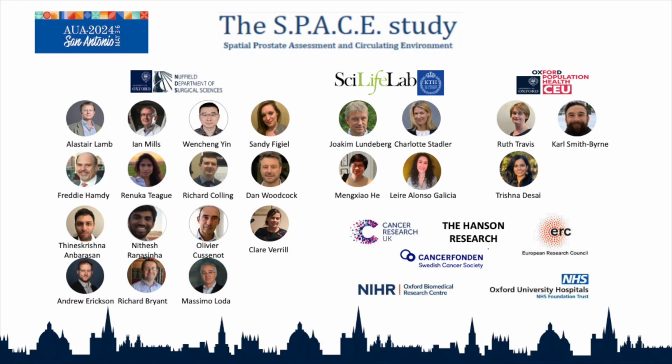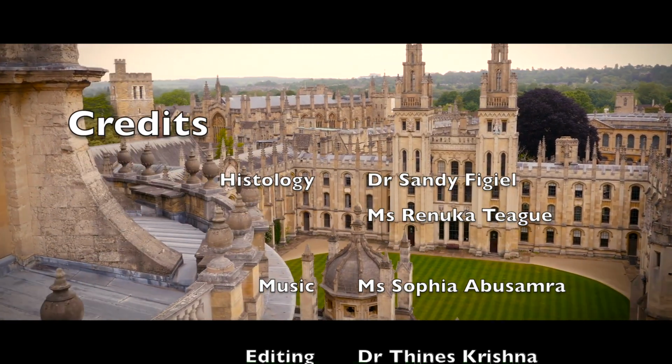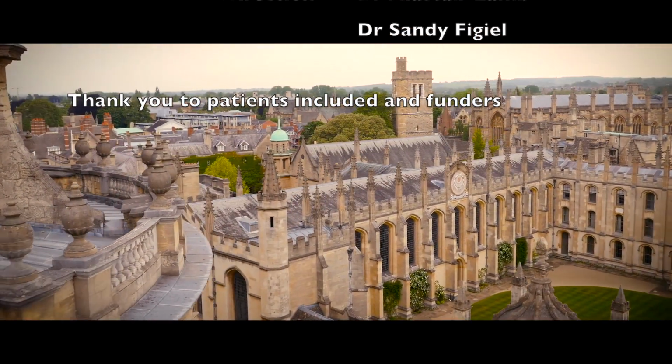We at the Oxford Prostate Cancer Biology Group are excited to share this video protocol with the wider scientific community. This work is part of the SPACE study, where we are uniquely positioned with our expertise on spatial transcriptomics to identify the lethal clone within primary prostate cancer.